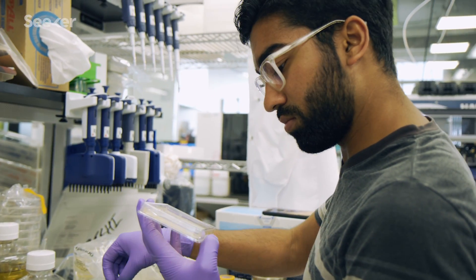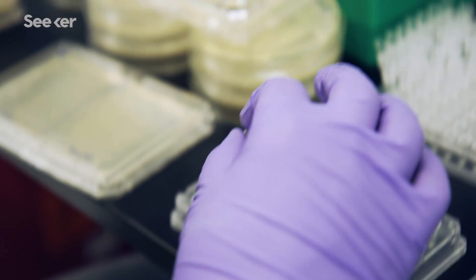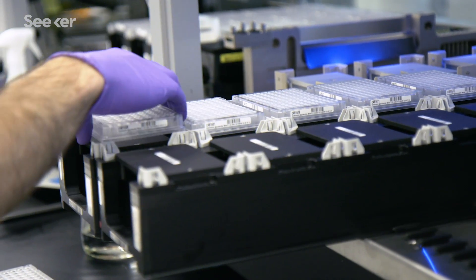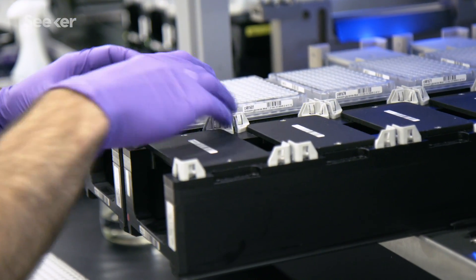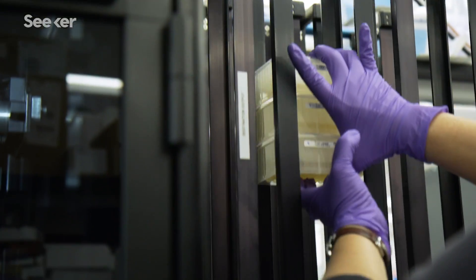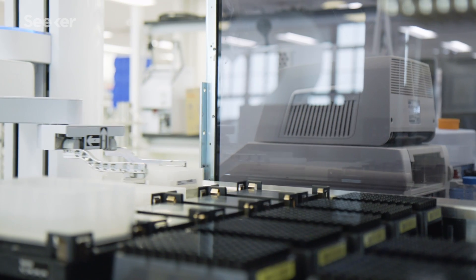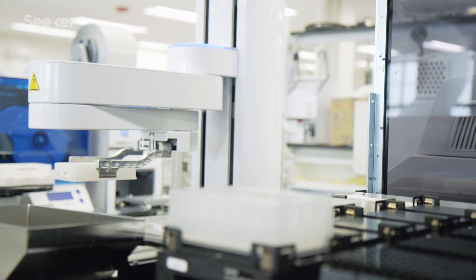As a graduate student, when I was doing an experiment, I was always thinking about the 10 or 20 samples that I could physically handle on my own and fit into an apparatus to answer a question I cared about. Here we can do things at scale. We will maybe design a library of 1,000 or 5,000 genes, and then we can take those and screen those all in one go, find the best candidates, and then use those to build the best possible pathway.